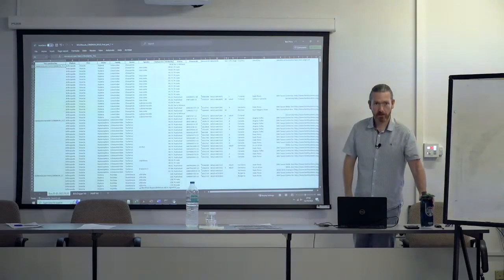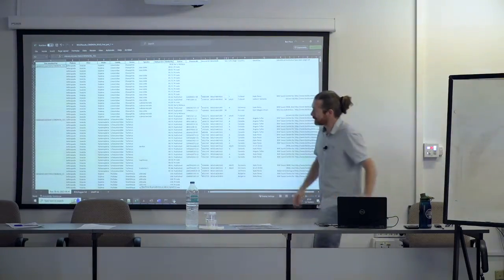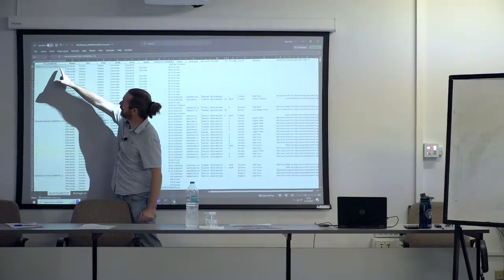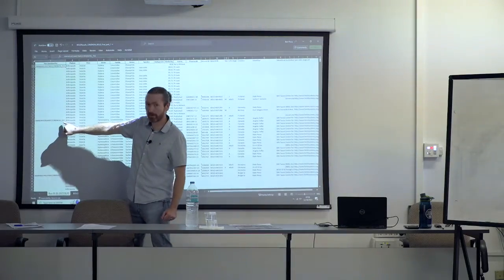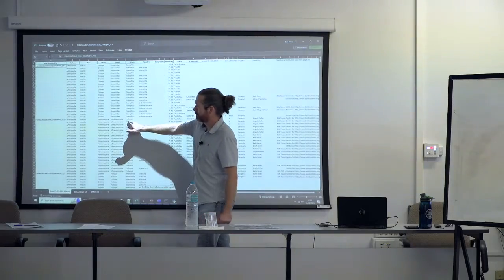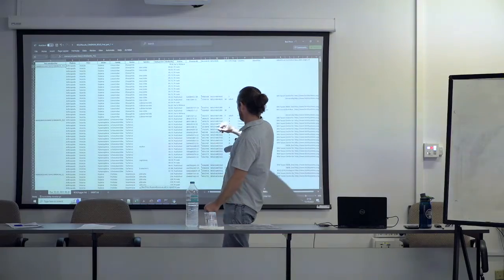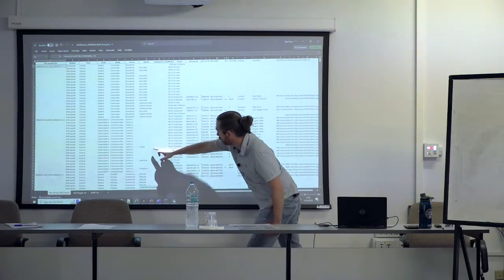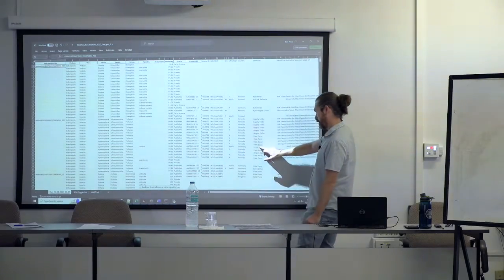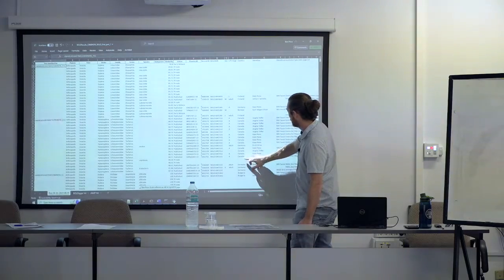Yeah, Glenn. Is each row there one of your query sequences? So yeah, sorry, that's a good question. These are the top 20 matches for that query. So that's F11. And here's G12, remember G12 from earlier? That was an ichneumonid wasp in that genus, and there's one species level match at 99.74, and it was identified by that person in Germany, interestingly, when the rest of them are Canadian, which is a bit bizarre.